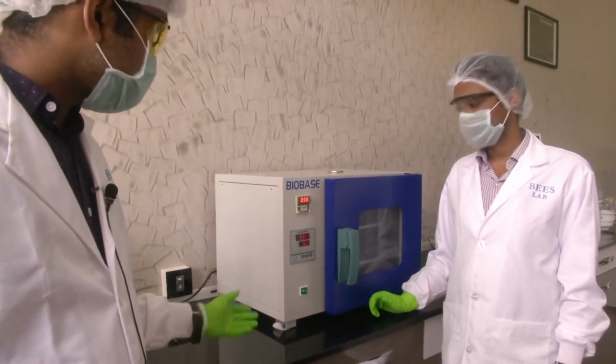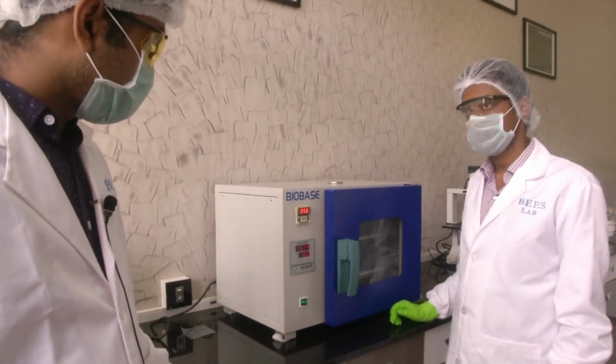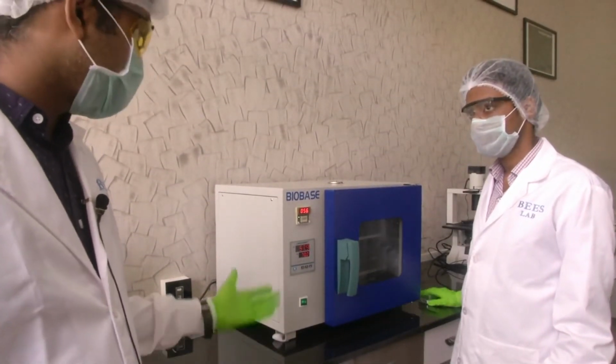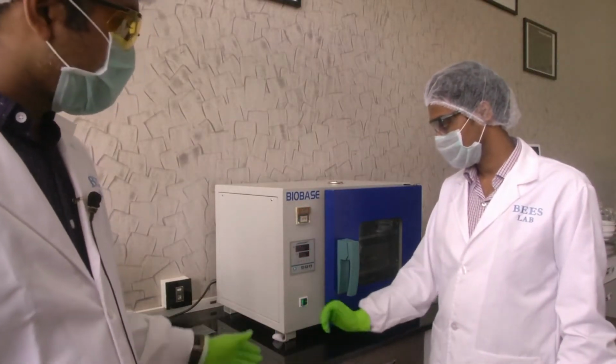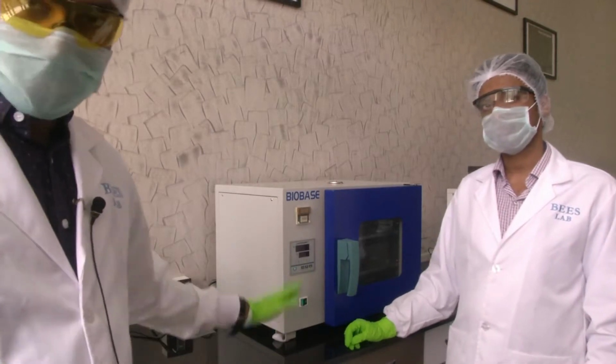Now let us switch it off, and once we switch it off, it will ramp down to a normal temperature. So Suman is switching it off. Before we open or close the oven, you should switch it off.